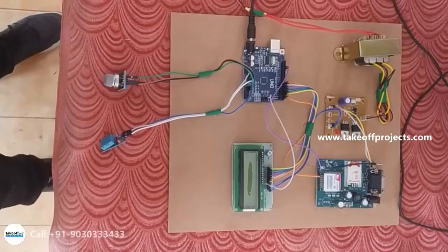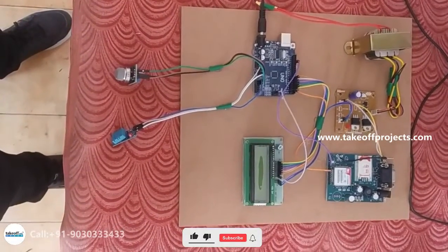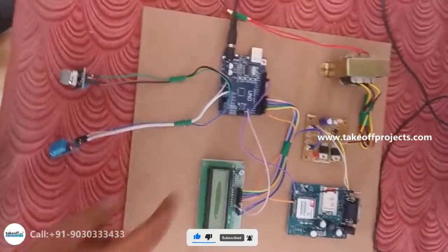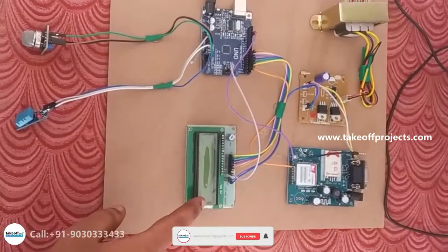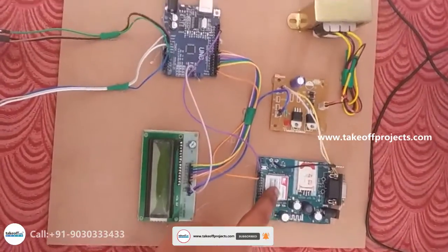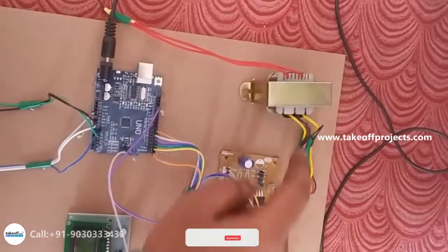Hello, this project is a device to check harmful chemicals in fruits and vegetables. The components used in this project are: Arduino Uno, a 16x2 LCD display, a GSM module which is used for communication purposes, a power supply, and a transformer.